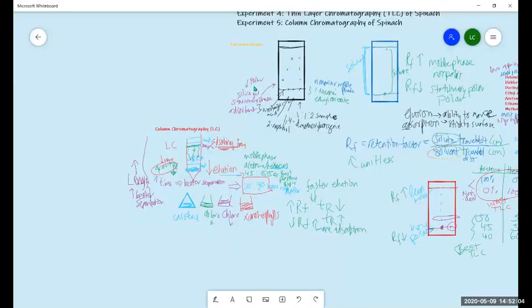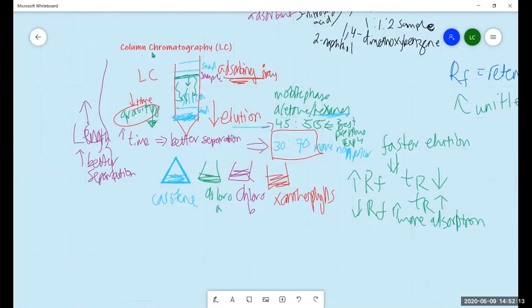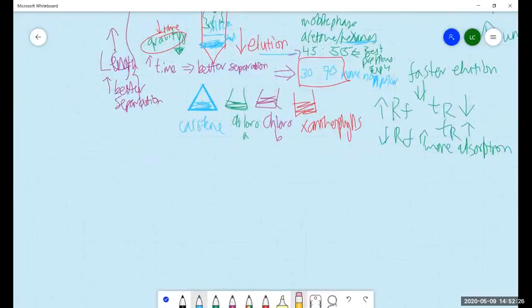The principle of separation was extraction for these 3 compounds. The same thing here. The principle of separation was column chromatography. So you were separating by doing column chromatography, you weren't separating by doing TLC. Well, in experiment 4, you did do separation by TLC, but here, there's nothing to separate if these were all pure components, right? If these were all pure, what are you even separating? There's no point in doing that.